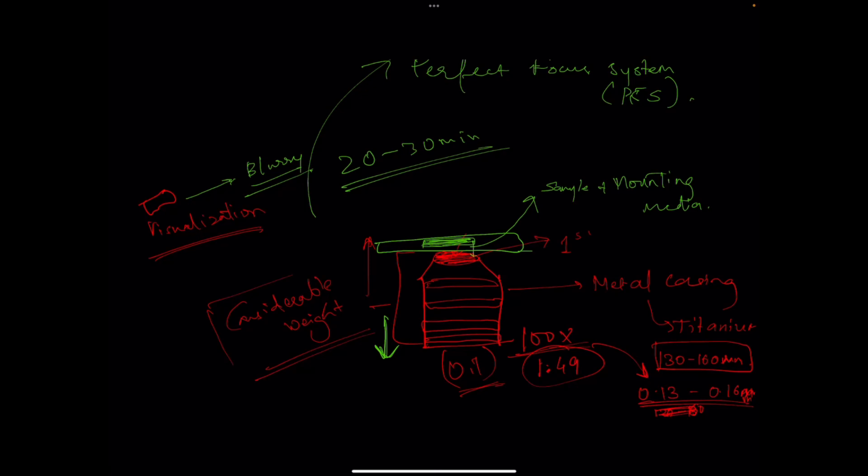Now, how this PFS was developed, what is basically the mechanism by which the microscope does that, is a topic for another video. But here I want to explain it with reference to why we are choosing the refraction media, basically the immersion media. So in this case, what happens if your PFS has to be activated? Basically, it's a function in a microscope.